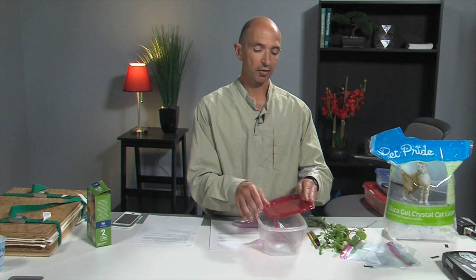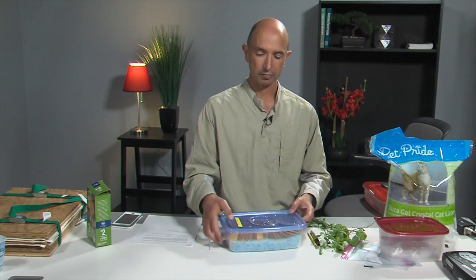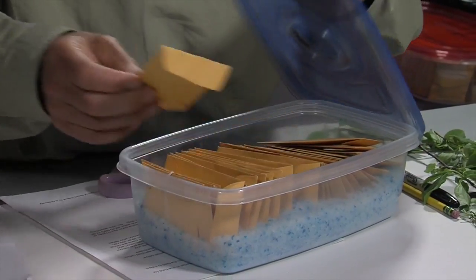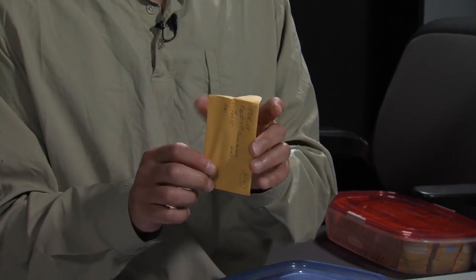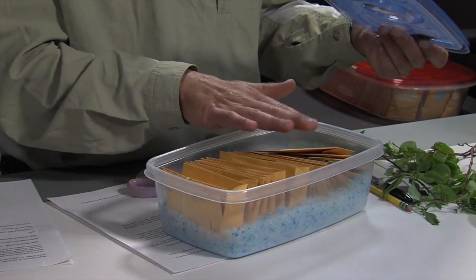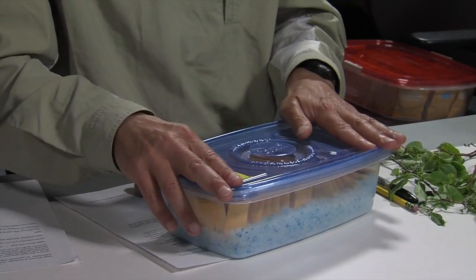This isn't the only way to collect. If you are in a moist area, if it's raining, keeping the individual samples in plastic bags is a good idea, but if you're in a desert or dry area, there are alternatives. You can have your sealable box full of silica gel, and then you could collect your samples into individual envelopes. And so the identifying information is now on the envelope. There's no silica gel in the envelope, and the leaf is protected in there. This works, as I said, in a desert or an area where it's not raining or too humid.